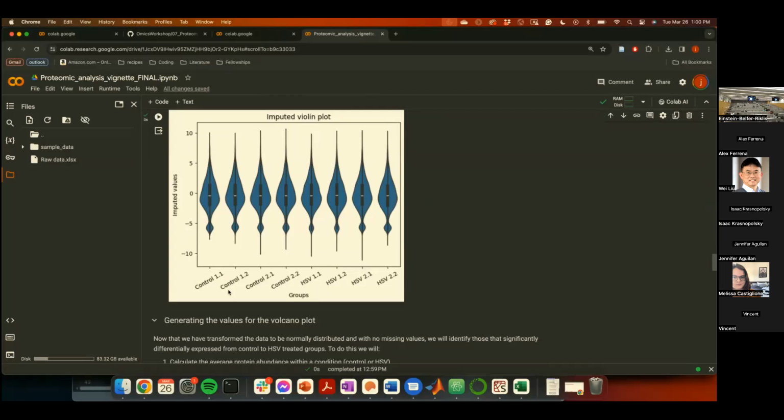So 2 standard deviations, left and right, correspond to about 95% of the distribution of your data, which means that if we move 2 standard deviations to the left, there is a minus sign in front of the formula, we land in that 2.5% of the low abundance detectable proteins. That is the area that we define as background noise.